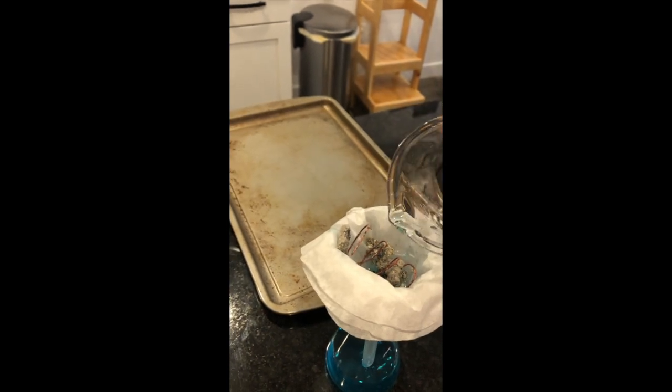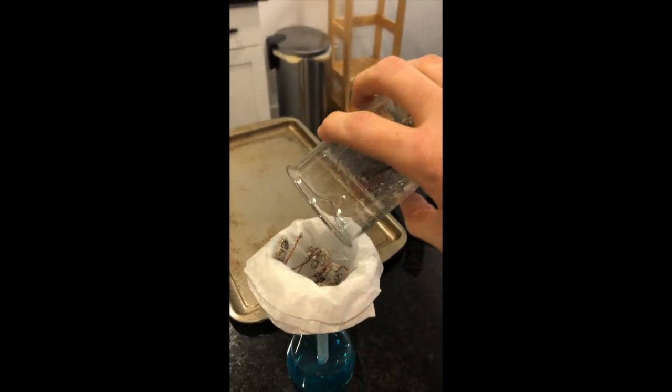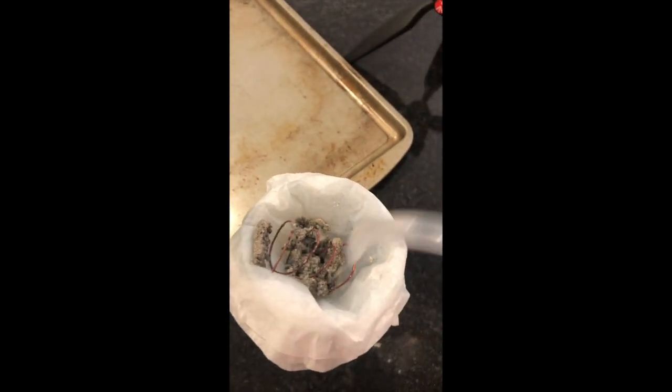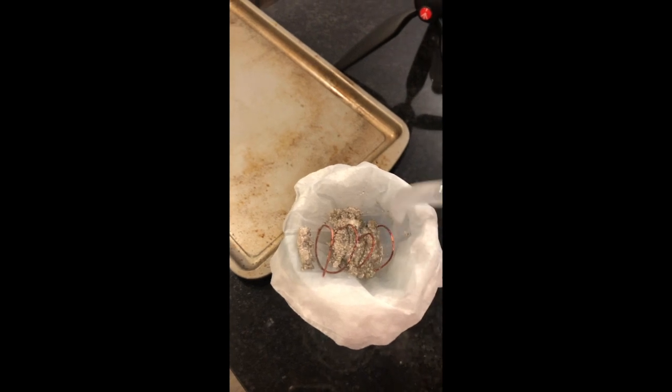Okay. I've got some silver chunks in there. I'm going to put my phone down and scrape out, and then I'll come back once we get some weights. All right, there's our lovely clumpy silver here. So I just have some distilled water that I'm going to squirt it with to try to clean off any of the solution, as well as to clean off our wire so that when I weigh it, I don't take any of the silver with me. Because the goal is to keep as much silver as we possibly can.